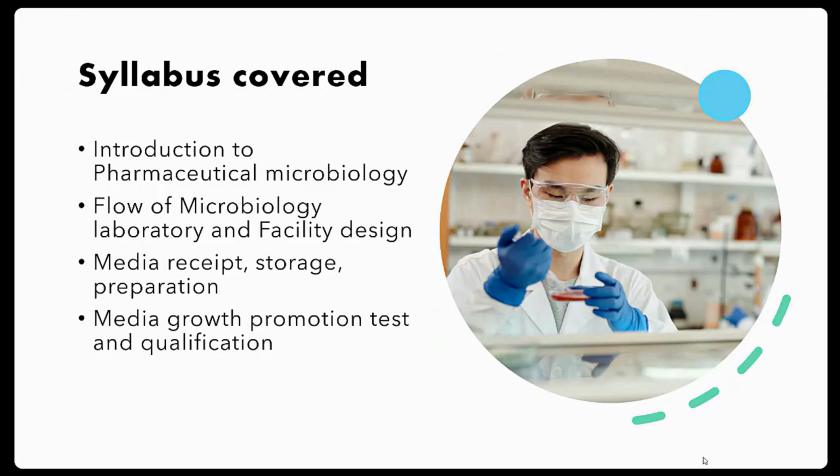Next, we'll go to the flow of the microbiology laboratory and facility design. The microbiology facility should be designed in such a way that it avoids cross contamination from person to sample or from sample to person. And the flow of materials and the movement of persons will be discussed in this chapter.